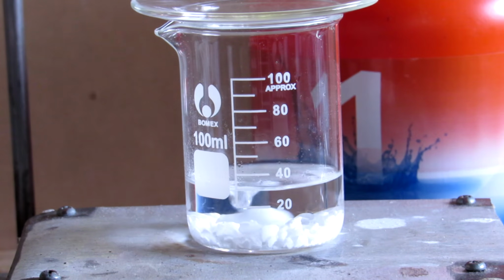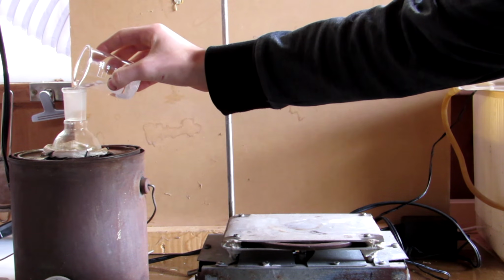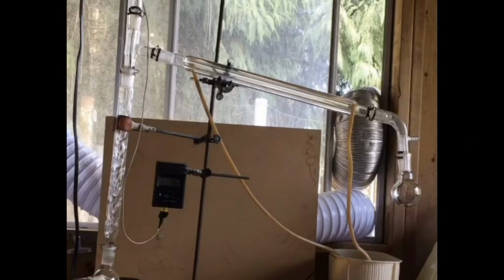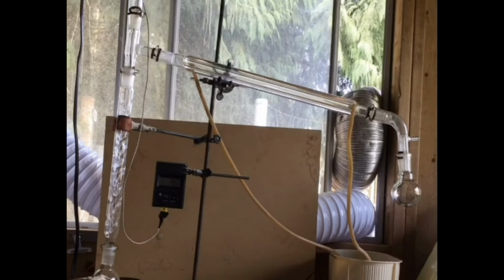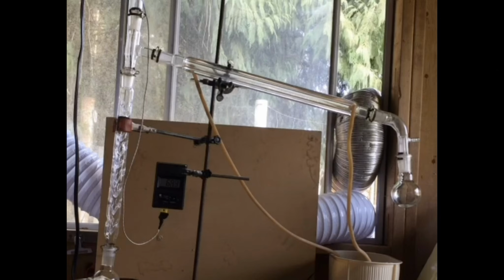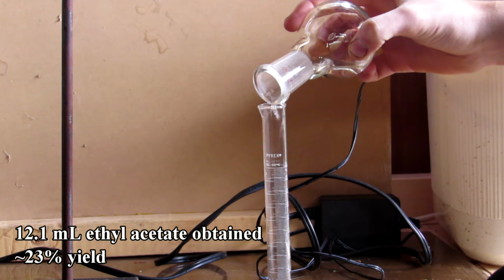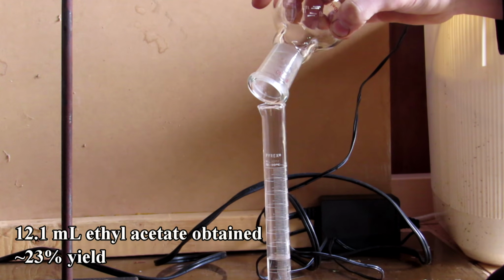After stirring for around 15 minutes, the ethyl acetate was decanted from the calcium chloride into a 100 milliliter round bottom flask, and a fractional distillation apparatus was set up. If there is any ethanol left, it should distill as an azeotrope with the ethyl acetate and come over first around 71 degrees Celsius. After that, pure ethyl acetate should distill over around 78 degrees Celsius. In total, 12.1 milliliters of ethyl acetate distilled over around 78 degrees Celsius, corresponding to a 23% yield based on the starting ethanol.